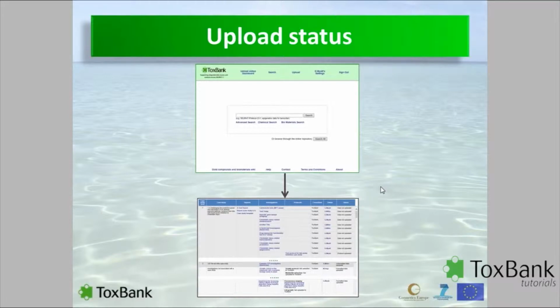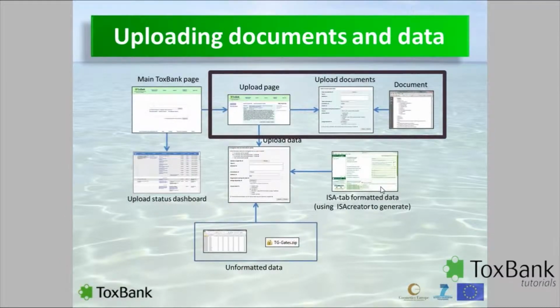So any protocols, investigations, as well as status information, are first organized by those case studies, and then any unrelated investigations, protocols, documents or reports that are not related to those case studies are also listed, and you can see the status of that information.